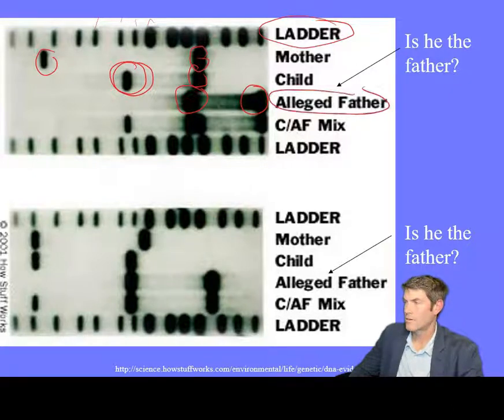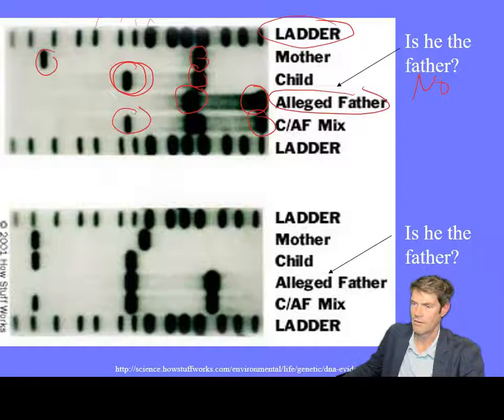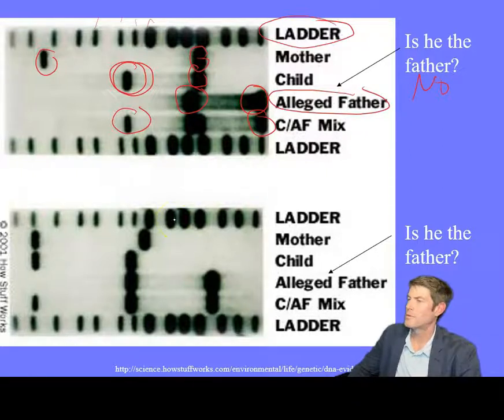If we look here, alleged father, no matching. Now, here's a child and alleged father mix, so mixing them together, I guess. I'm not sure why they would do that, but we don't see that there. It's pretty close to here, but it's not quite matching.